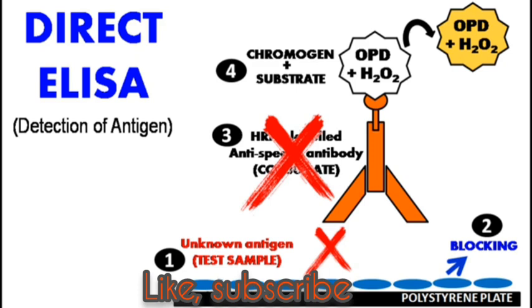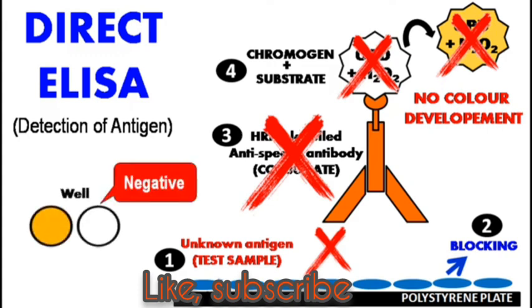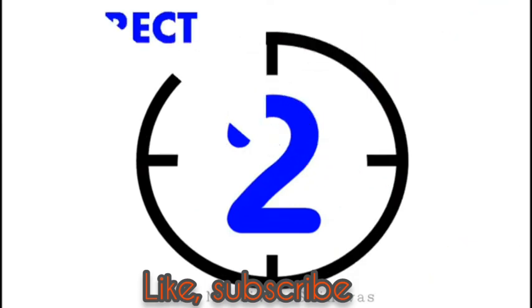So in absence of HRPO conjugate, no catalytic reaction, and therefore no color development occurs, which indicates the sample is negative. So, here, lack of color development indicates the test sample is negative, and color development indicates the test sample is positive.